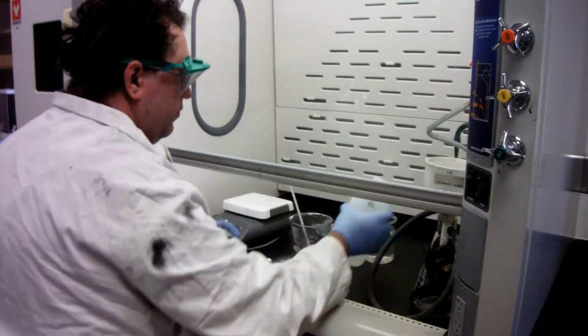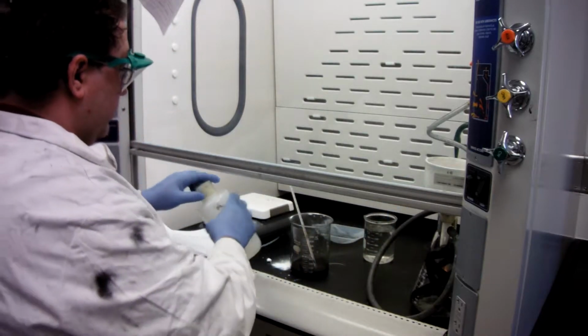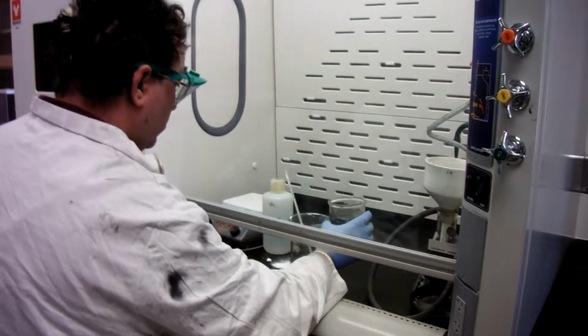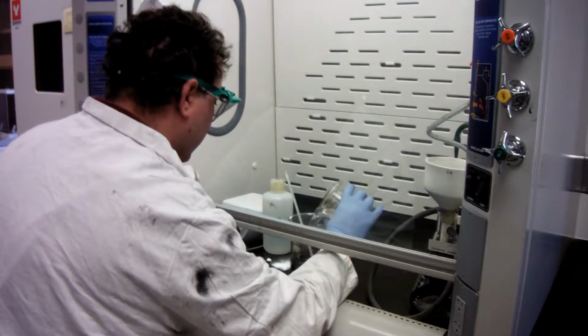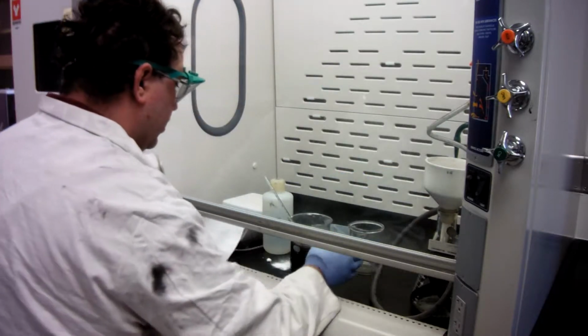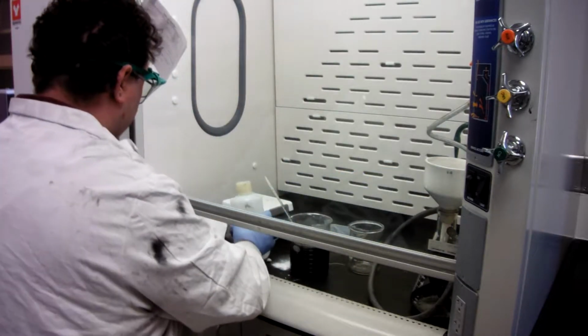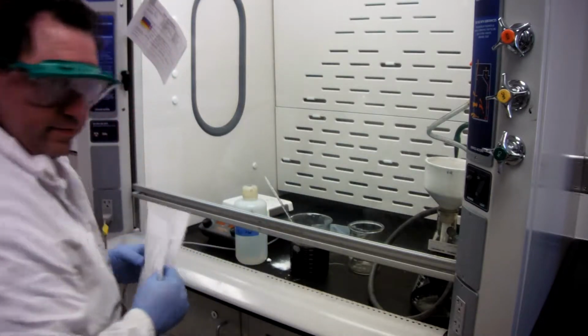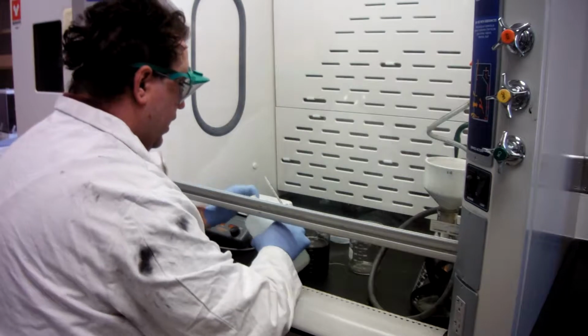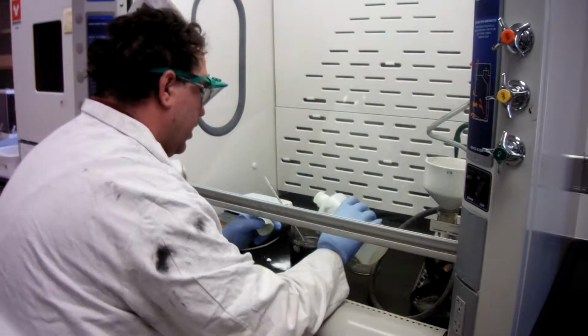So I'm going to put 500 milliliters in a beaker and then pull my hood down to protect myself in case of accidents and pour quite a bit in at once. We see that reaction going where the water is being heated, but since we cooled it, it's just fine. And I will fill the rest of the way up with DI water.